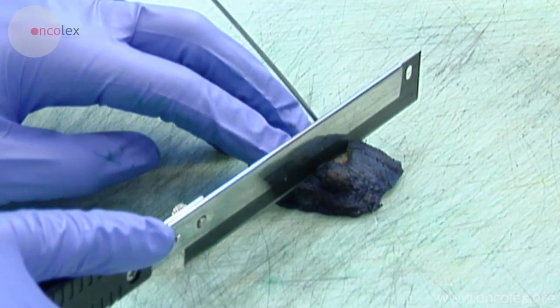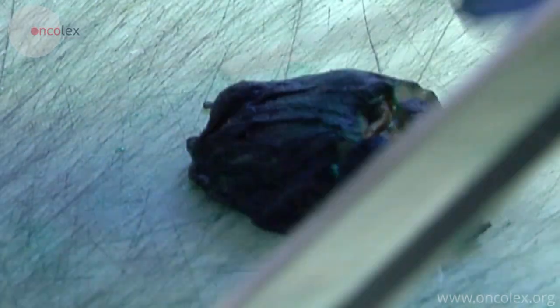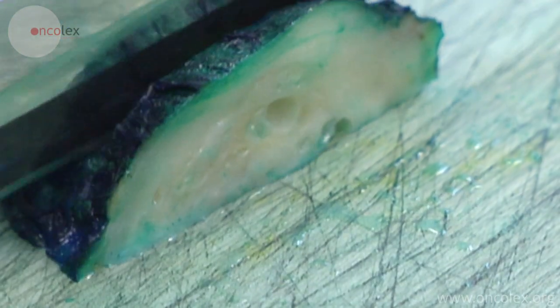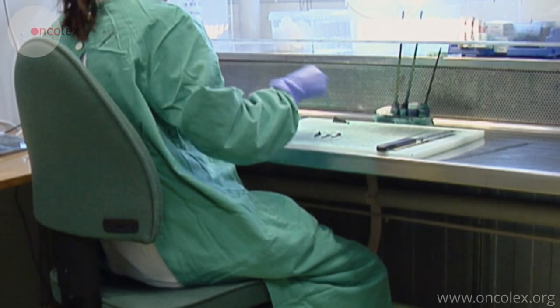Just like the apex, the base is cut in half through the urethra. Both halves are cut in sagittal slices, from the central to the lateral part. The seminal vesicles and vas deferens are cross-sectioned and all the slices are placed in one to two containers.